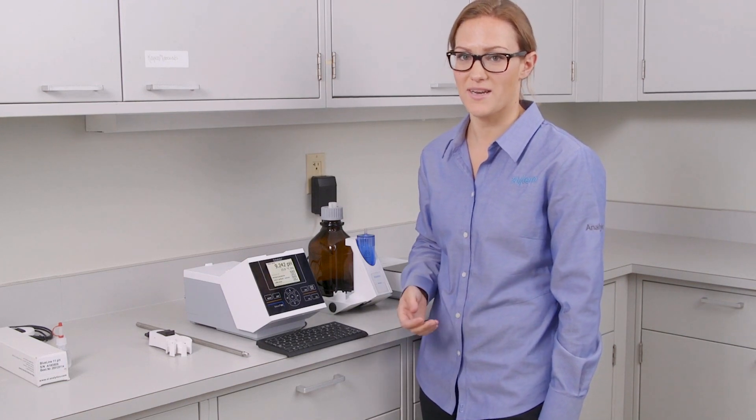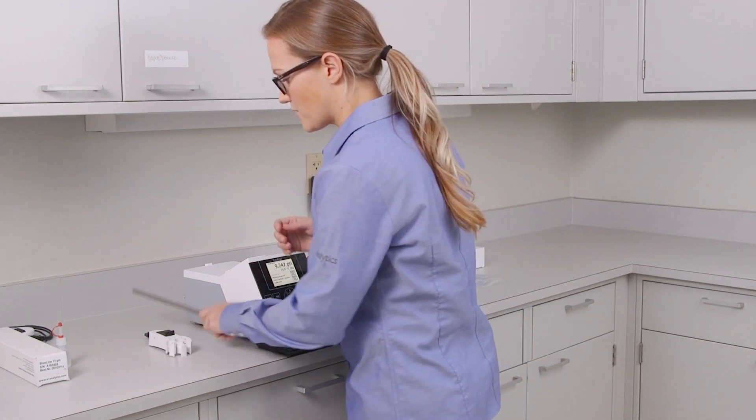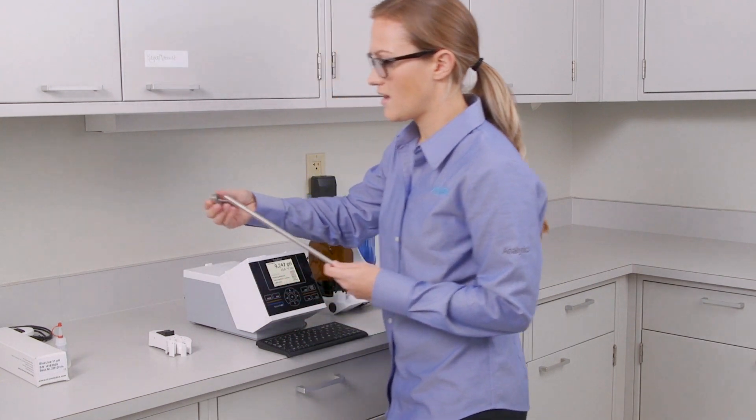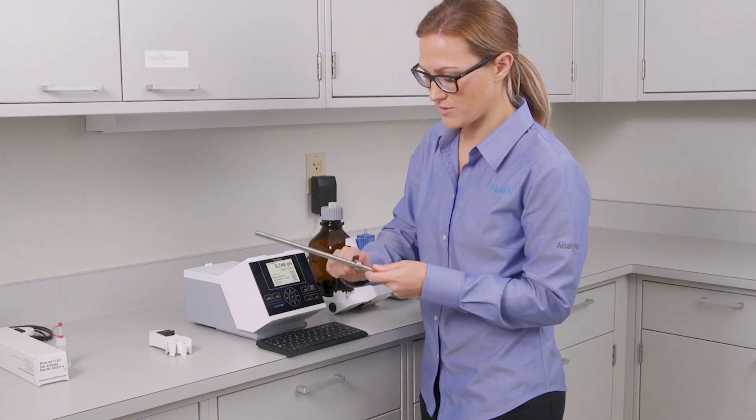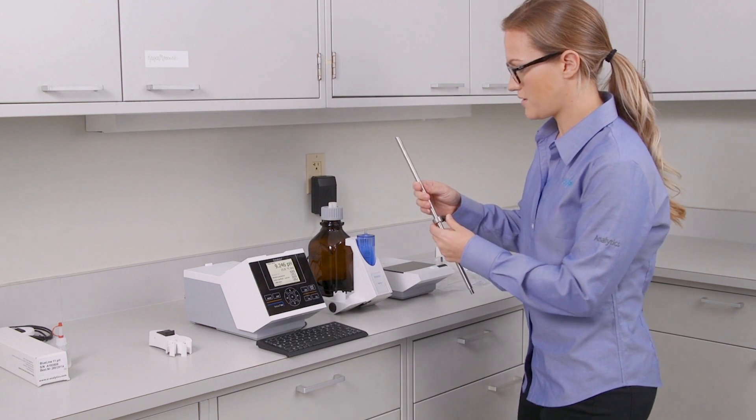Just a few more steps to get the magnetic stirrer set up. So you'll take your stainless steel rod and the clamp and just put it right over and secure it in place.